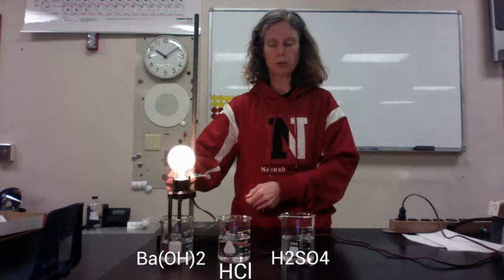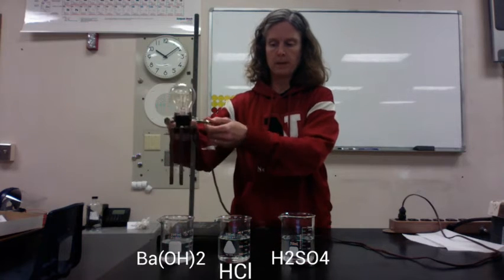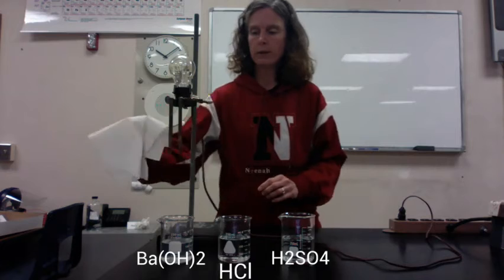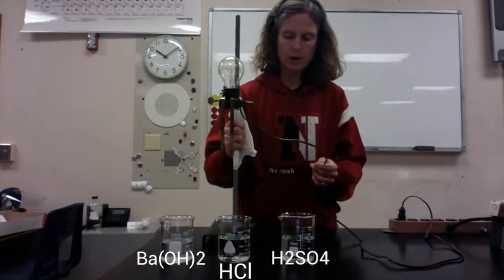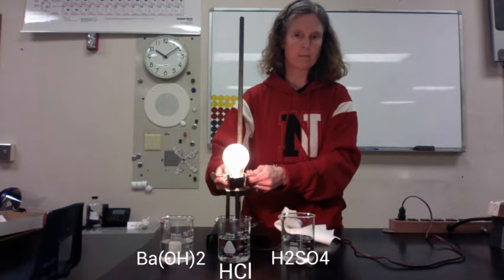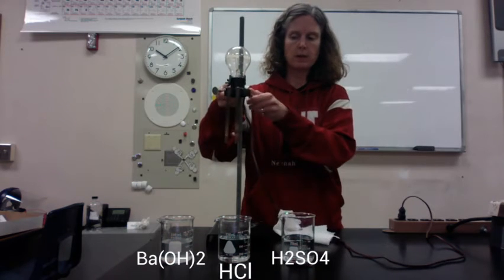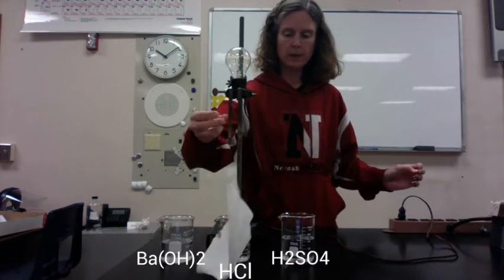So our first solution is definitely a conductor of electricity. Turn my power strip off, clean my prongs, move on to my second solution. It is also a conductor of electricity.